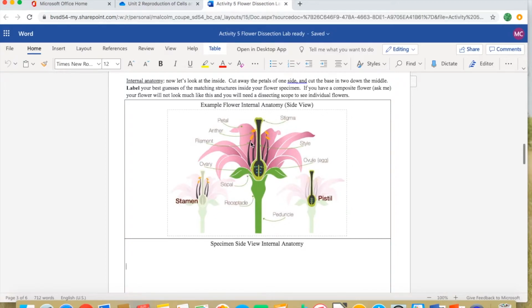The male structures here on the side, highlighted here in black, are called stamens. On the tip of the stamen, on the anther, the stamen produces pollen. The pollen is the male reproductive cell. When the pollen gets to the stigma of a different flower of the same species, the pollen grains can break open, and some of the male reproductive cells, basically plant sperm, can make their way down this tube right here and into the ovary and fertilize the ovules.